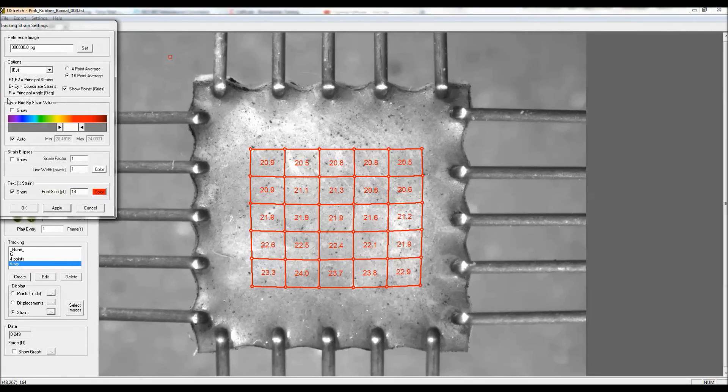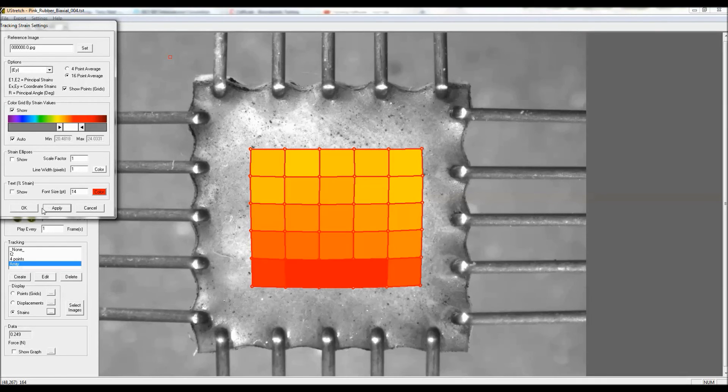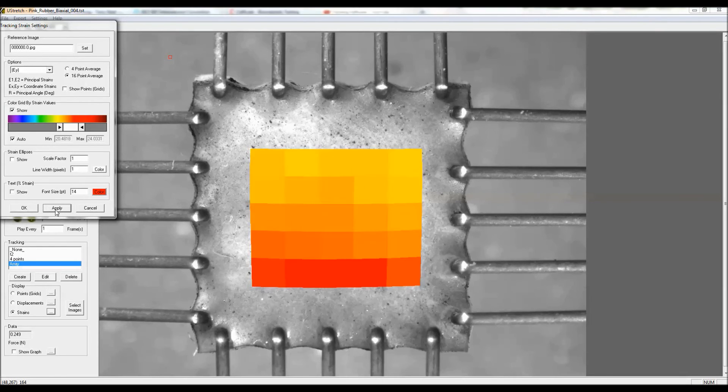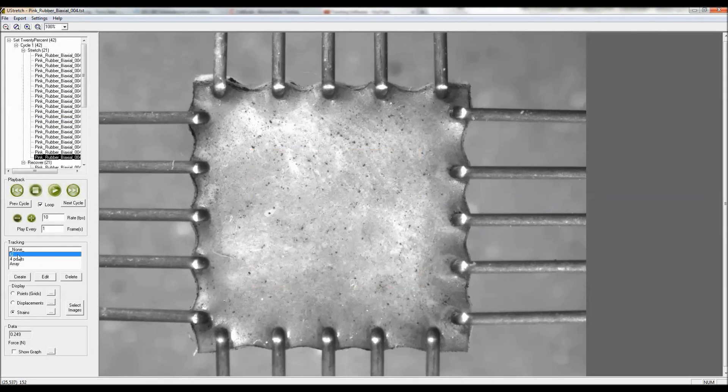I'll just jump over and show this as a coloration scheme rather than looking at the numerical values.